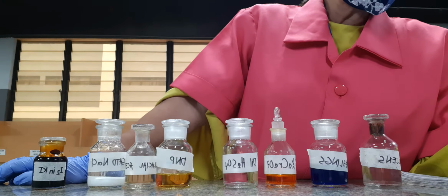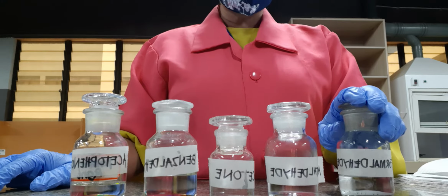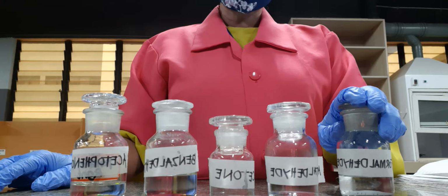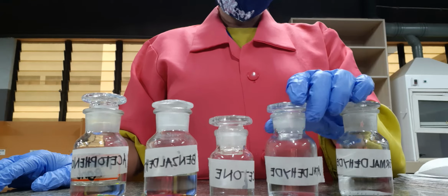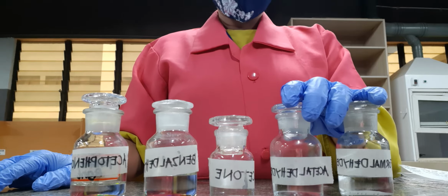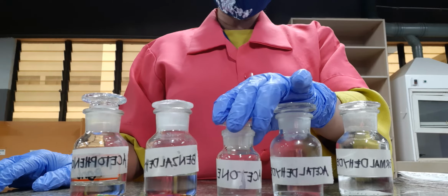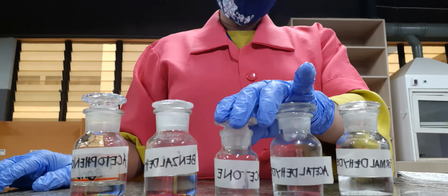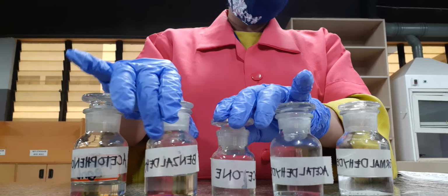Okay, so we have here in test tube number 1, formaldehyde. It means you have 1 carbon atom, so we have HCHO or C double bond O H2. Then we have the acetaldehyde, which contains 2 carbon atoms and a carbonyl group, and then we have acetone, which is CH3, C double bond O and CH3.